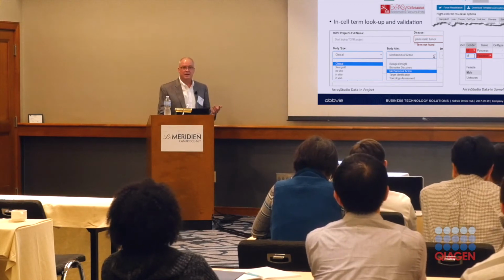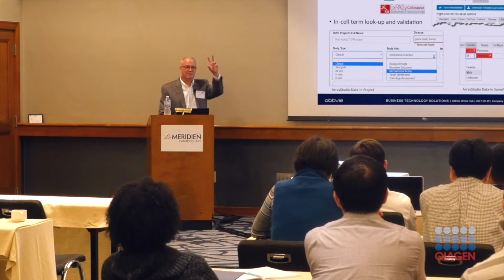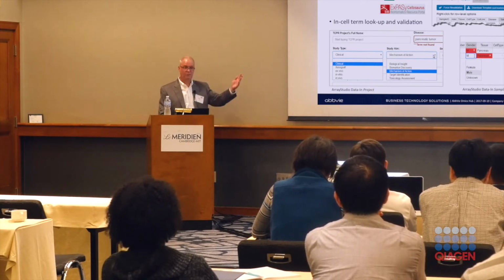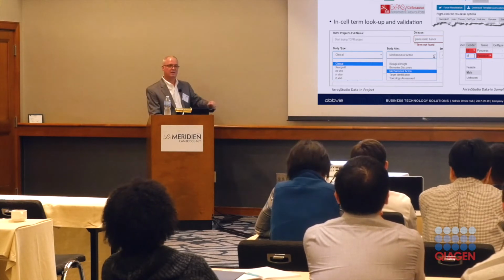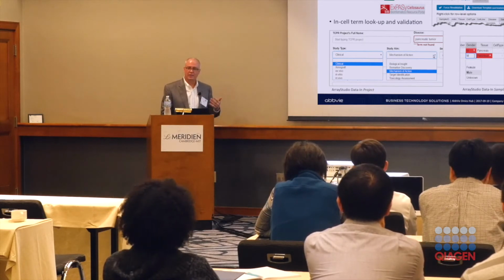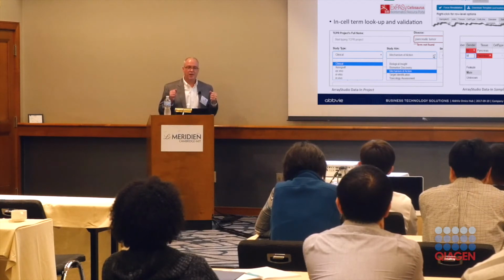Now, at the end of this process, we still end up with a text file, sample set, samples. Currently, it's a manual register the samples, but the very next step would be, if they're satisfied, to send it directly for sample registration. We don't have that yet because, of course, it's very difficult to think of every possible column that every researcher is going to want to have, right?